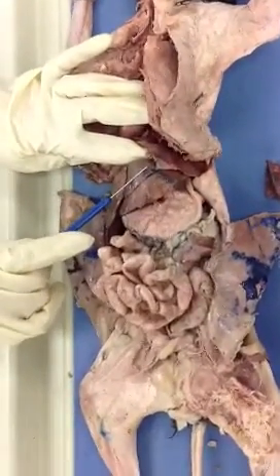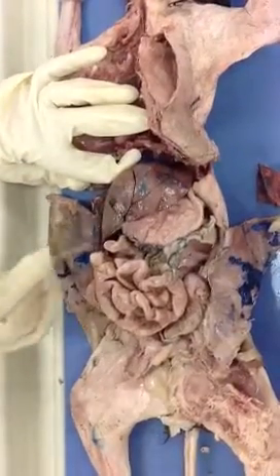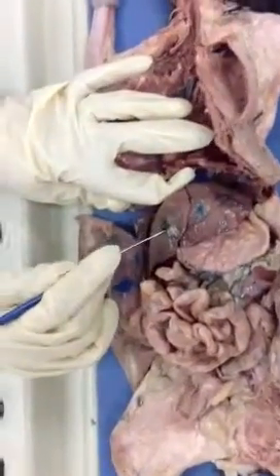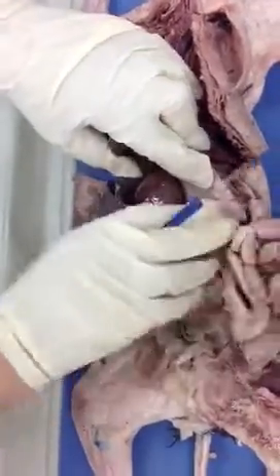This is the medial lobe. Very good. And this is the right medial. What is this pouch that I encountered in the right medial? Gallbladder. Excellent. Very good. Now, let's continue.